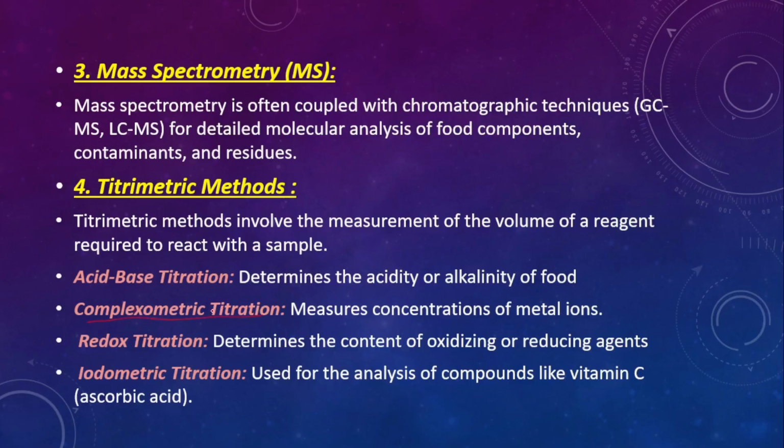Complexometric titrations are a type of titration that uses a chelating agent such as EDTA to form a complex with the metal ions in solution. The chelating agent binds to the metal ion in a 1:1 ratio, and the end point is typically indicated by a color change from a metal-ion indicator complex. These titrations are used to determine the concentration of metal ions in solution, including calcium, magnesium, and other multivalent ions. The pH of the solution must be carefully controlled to ensure selective binding. A common application is water hardness analysis.